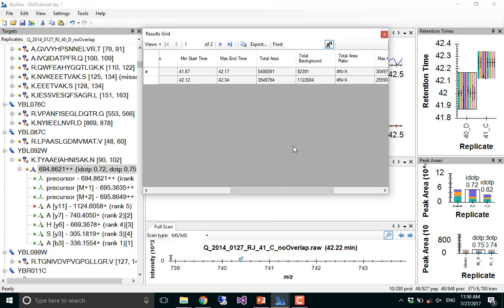One major gotcha is that a lot of people will have Skyline data and export it to a report or a spreadsheet. If you're doing this with DIA data where we've imported both fragment ion and precursor, and you just give it the total area, that's actually the summation of the fragments and the precursors together. So it's adding both of those. That's not what we want to be using for quant. For quant from DIA data, we want only the integrated signal of the fragment ions.